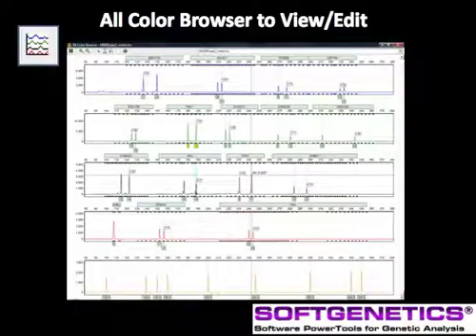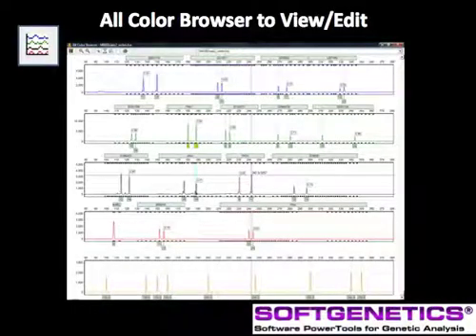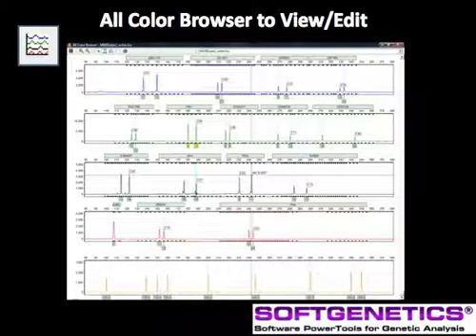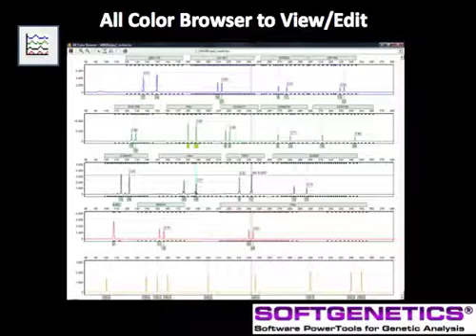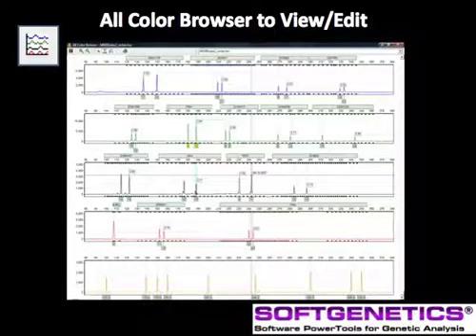Many labs prefer to review and edit files in the allele browser. The electropherogram and report tables in the main analysis screen are automatically updated with edits made in the allele browser view.